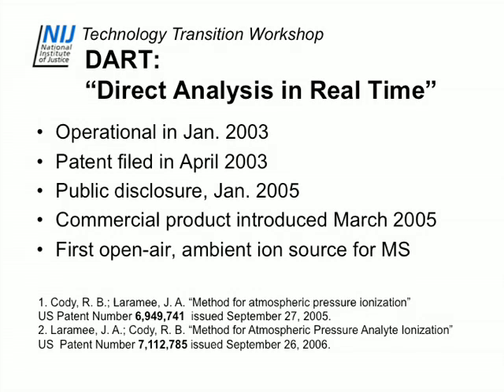DART and desorption electrospray ionization both were publicly announced about the same time. The DESI article from Purdue came out just before 2005, but I do think DART was first because we actually had it working in January 2003 and had the patent filed in April 2003. The two techniques, we can talk about them at another time. I think they're complementary, really. They're not exactly the same sort of thing.